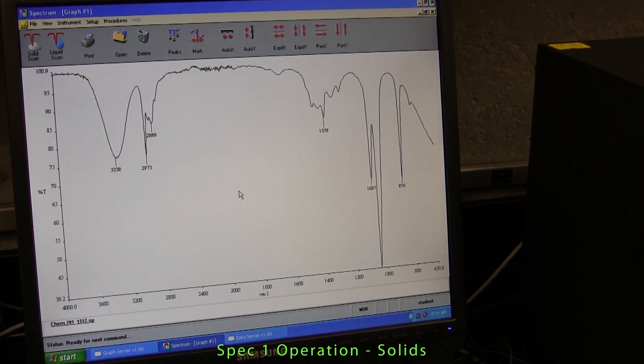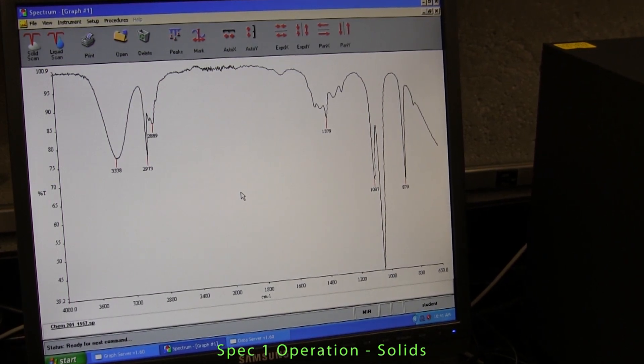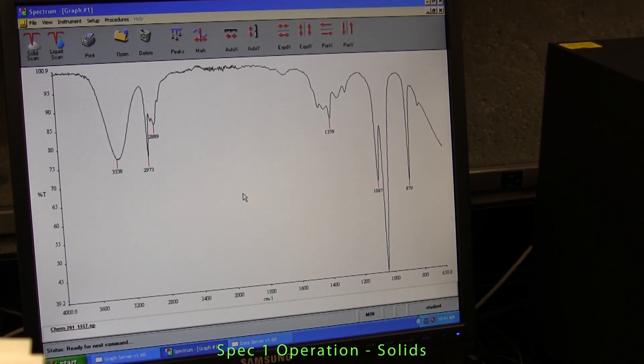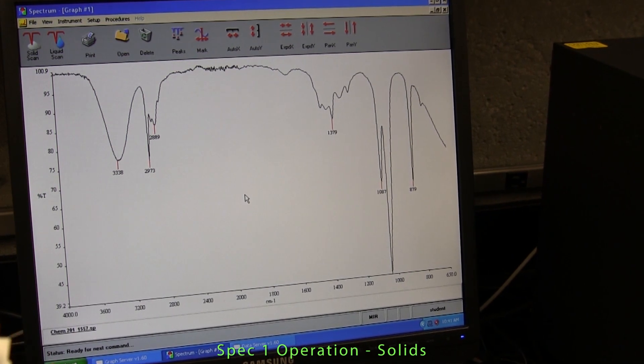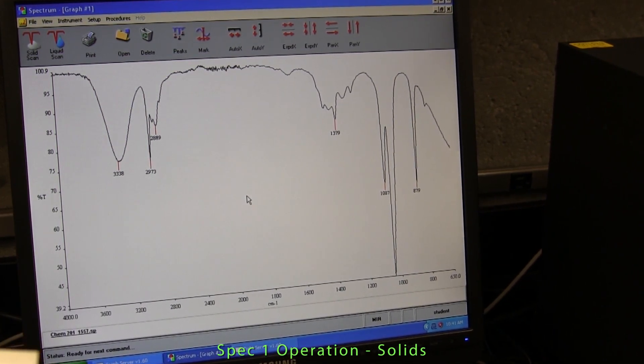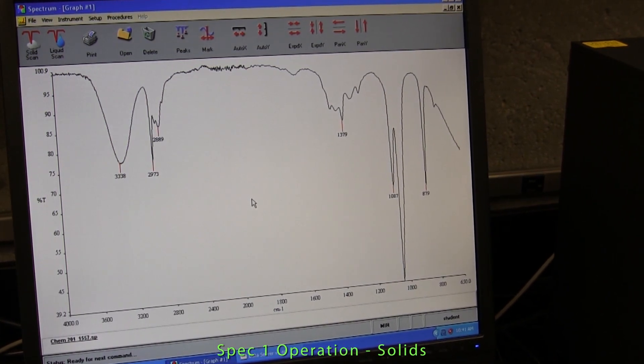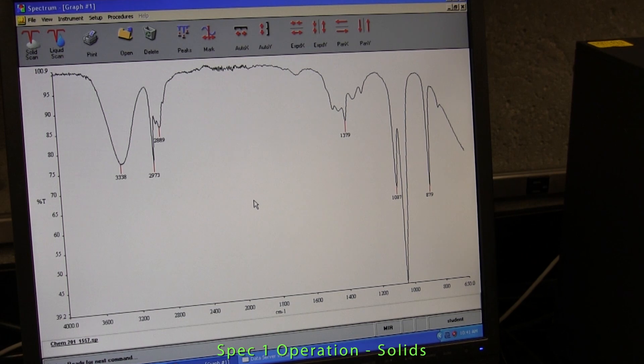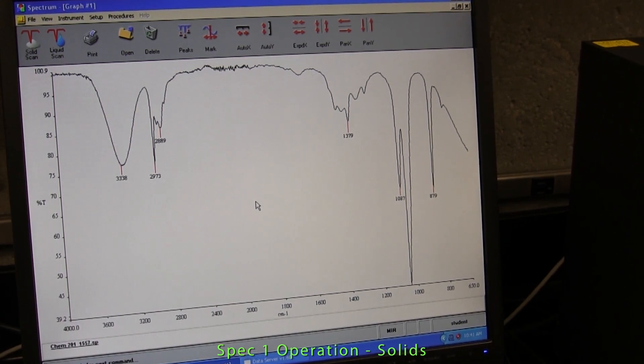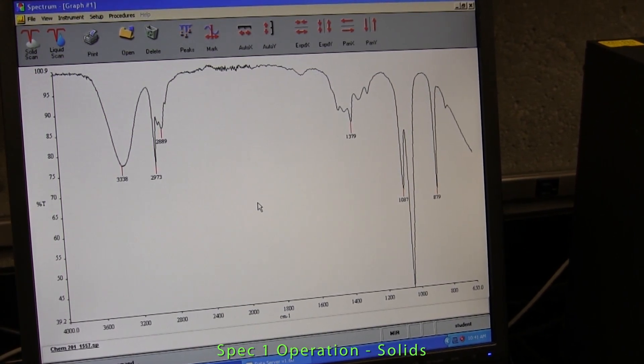The computer which controls the IR spectrometer will be switched on and the software, called Spectrum, will be up and running. If it's not, consult your lab supervisor or the lab technician. From here on, it's a fairly simple matter of following the on-screen prompts.